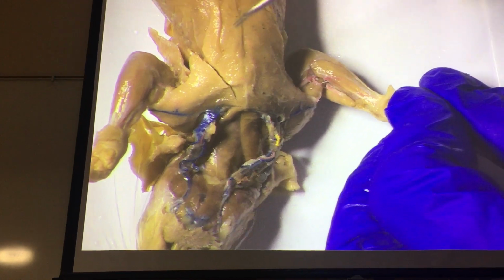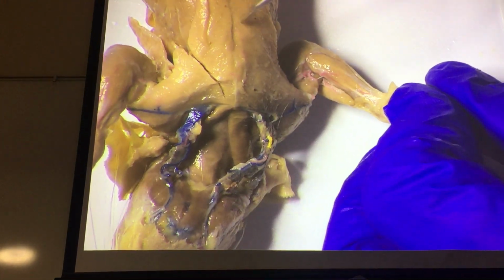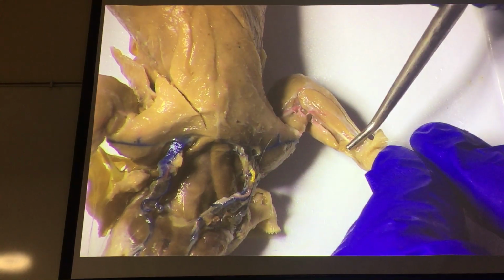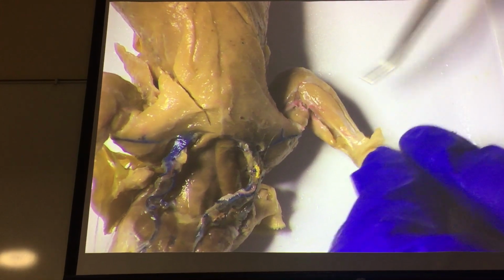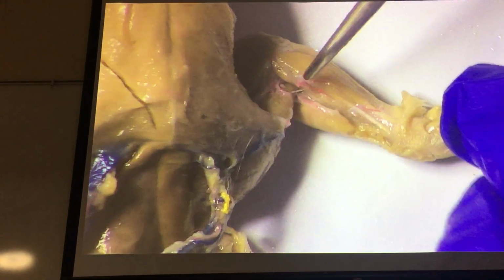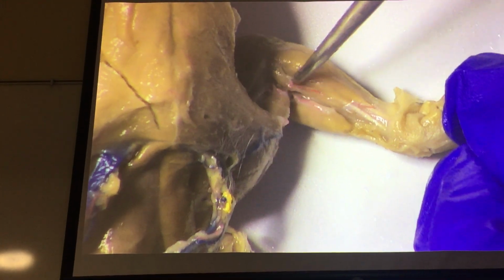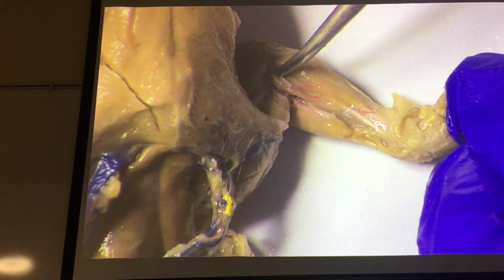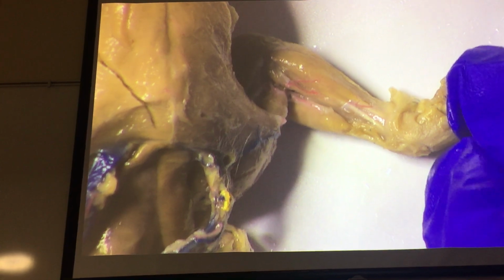And now we get to the forearm muscles, some of them. And they're kind of concerning because they're so tiny and it seems like there's a lot of them. But use landmarks as you go. Ventral, pronators and flexors. Dorsal, extensors. Radial side, ulnar side. So our first little muscle is short looking because it doesn't have to run the full length of the forearm to cause movement. That's the pronator teres, because it causes pronation.